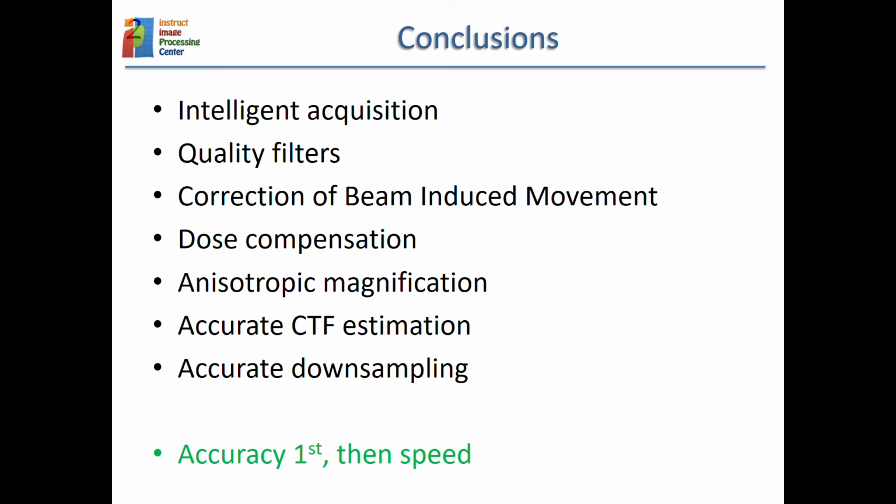We all like this real-time processing at the side of the microscope, and this is fine, but we should be aware that very quick processing may not be the best for the final reconstruction. If you want to make very accurate estimates and corrections at the beginning, then you may be ready to pay some time for that.